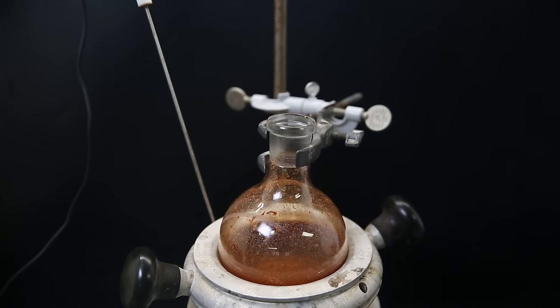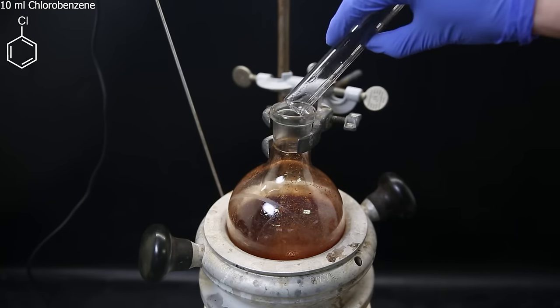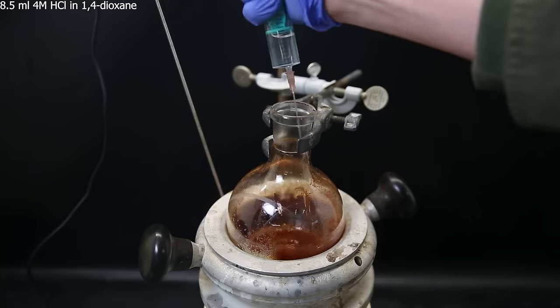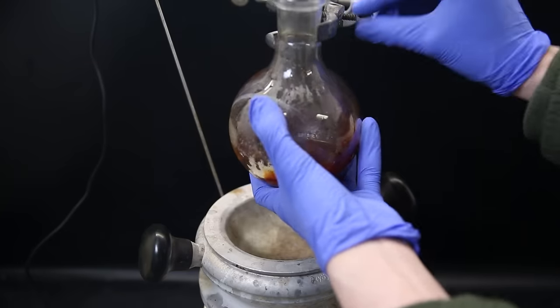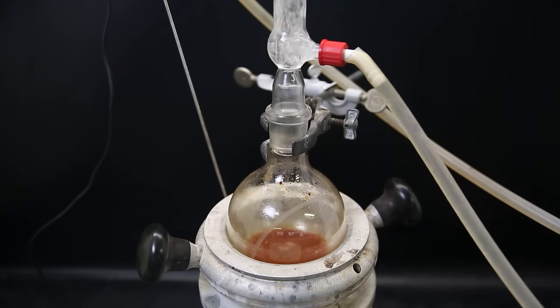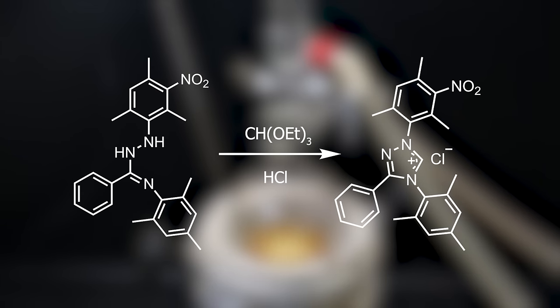I immediately continue with the next reaction, and I first add 10 mL of chlorobenzene as a solvent. I then add 11 mL of triethyl orthoformate and 8.5 mL of a 4 molar solution of hydrochloric acid in 1,4 dioxane. I shake the flask around to get all of the solids off the sides, and then attach a condenser. I heat the mixture to a mild reflux and leave it for 1 hour. In the reaction, the coupled precursor can form a triazolium ring in the presence of triethyl orthoformate and hydrochloric acid.